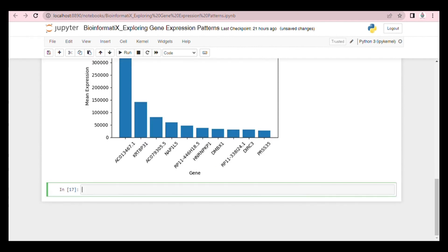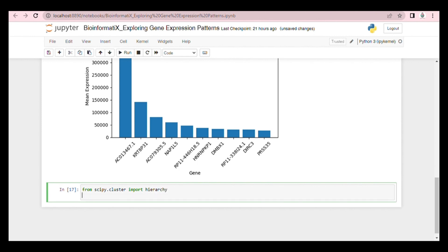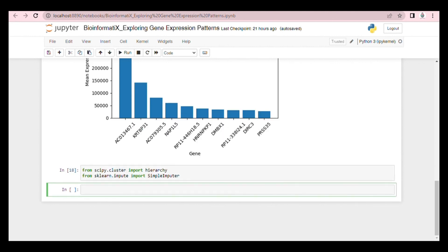Now let's make the gene expression correlation matrix. But before we make it, we have to import our libraries. Because in our data we have missing values, we need to perform mean imputation to handle these missing values.